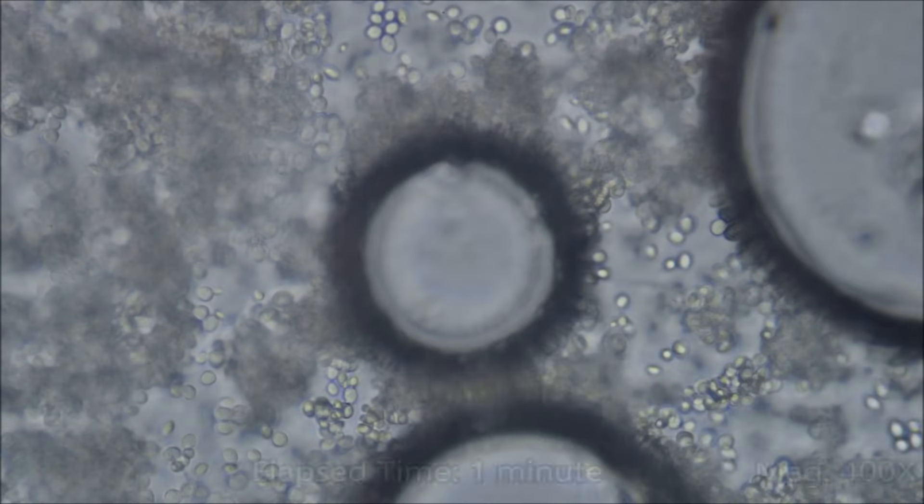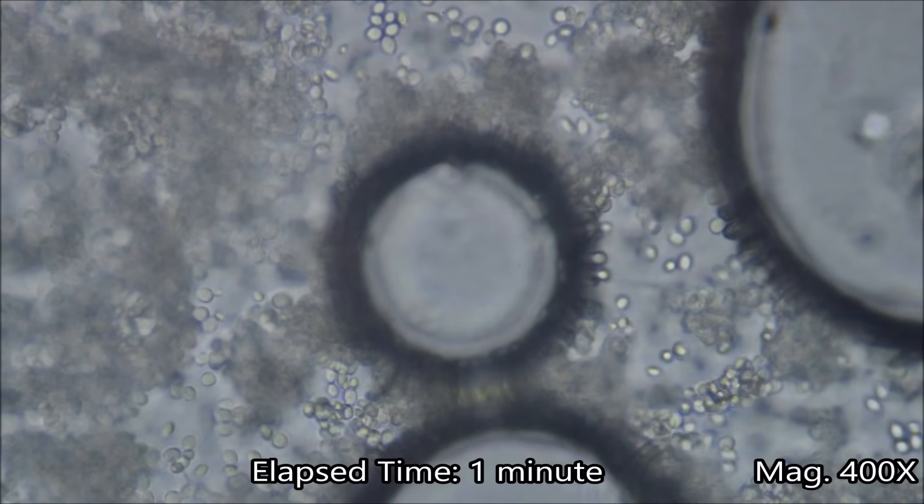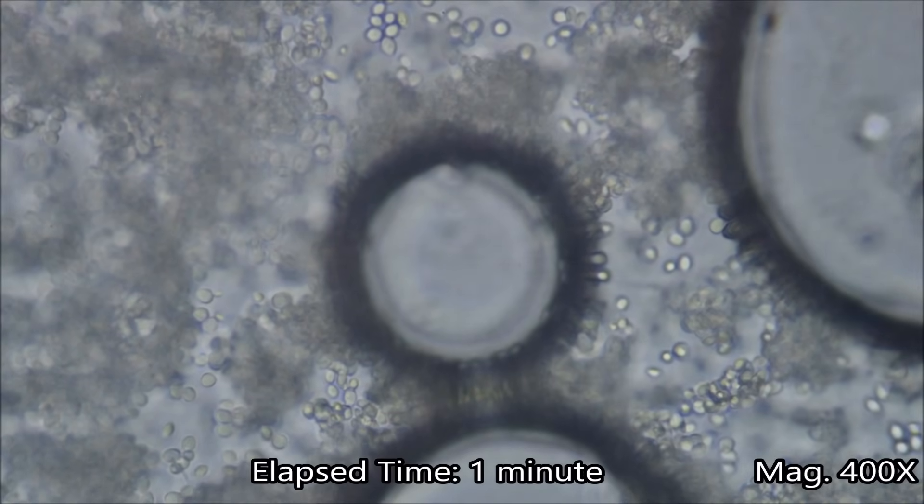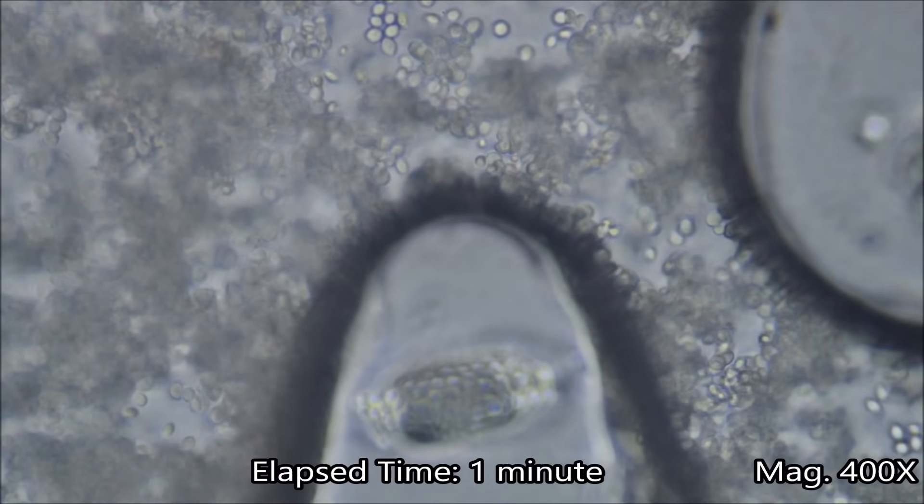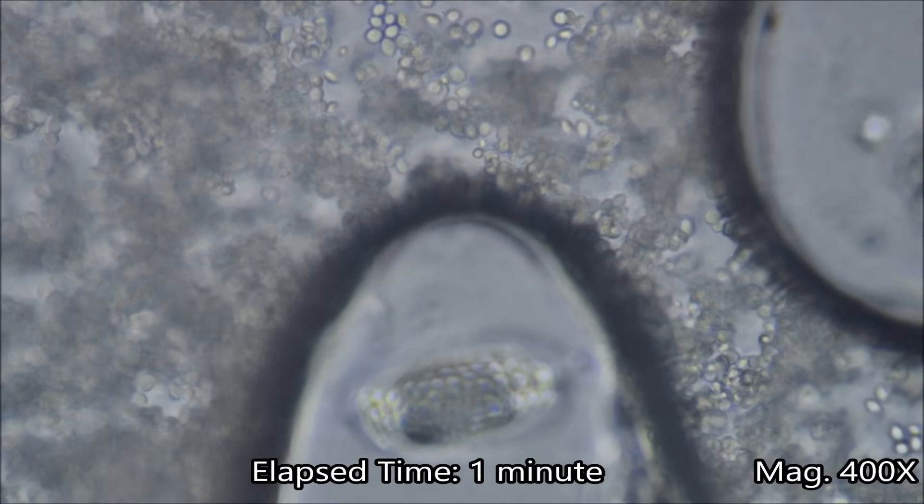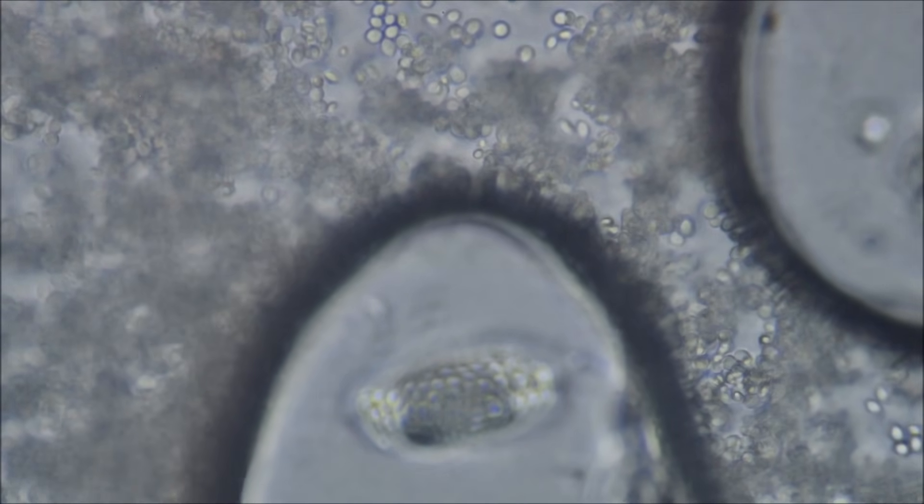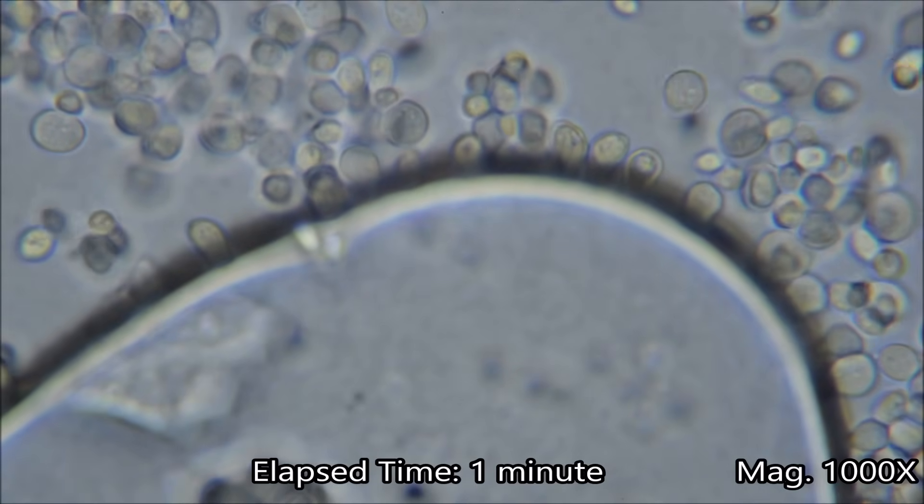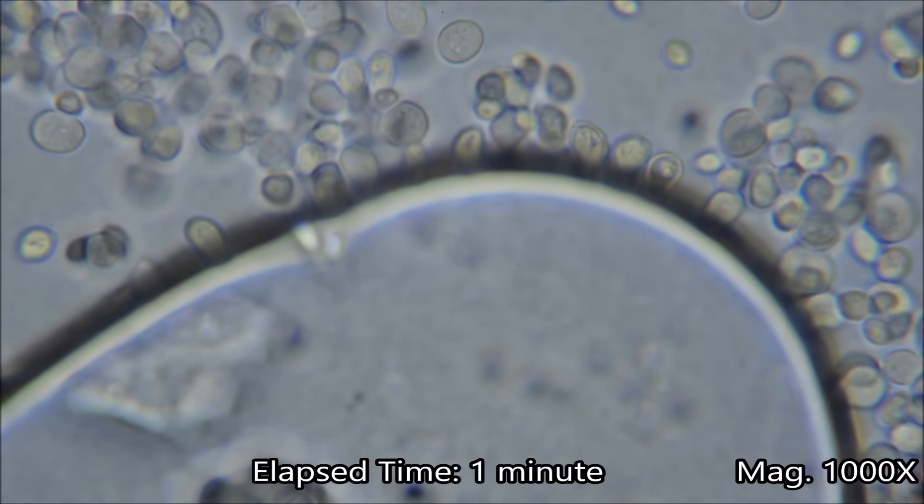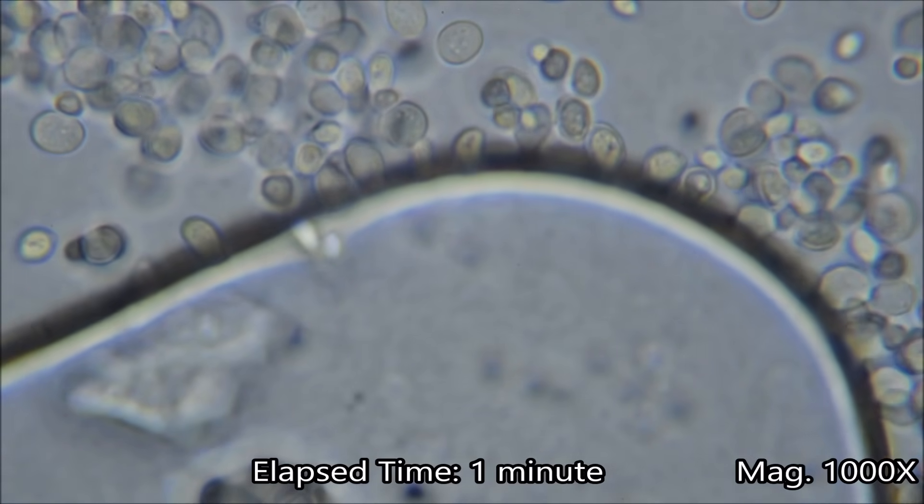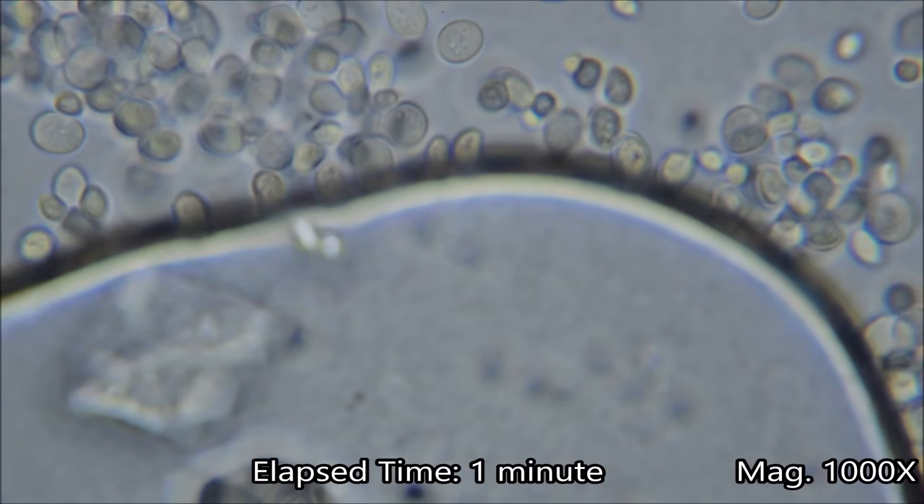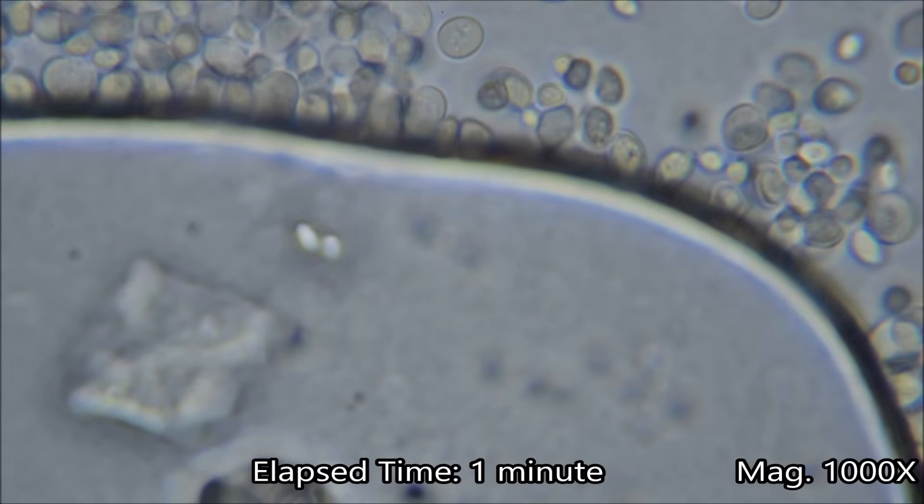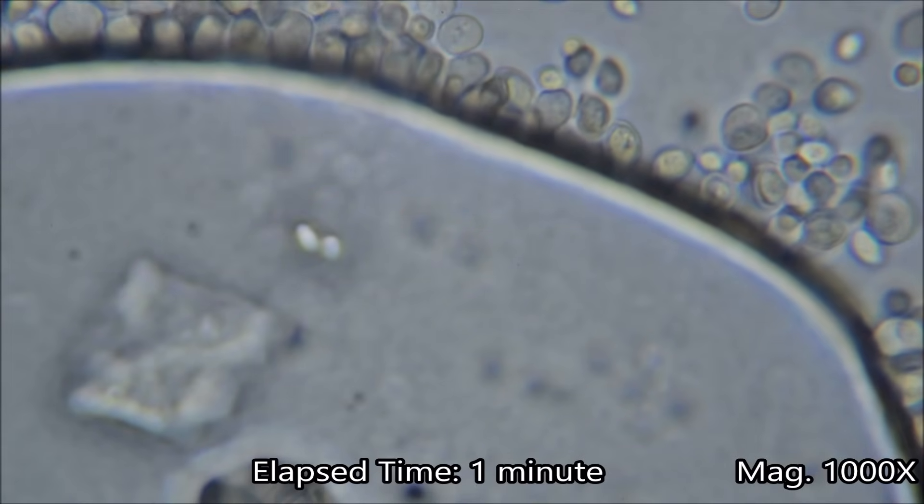At higher magnifications, you can see the yeast around the bubbles. The yeast collectively consume sugars and produce more and more carbon dioxide. They release the carbon dioxide they produce into their surroundings where it dissolves into the water. The amounts of carbon dioxide dissolved in the water continues to increase until the water is saturated with carbon dioxide, which means no more carbon dioxide can dissolve in the water. At that point, a carbon dioxide bubble can form.